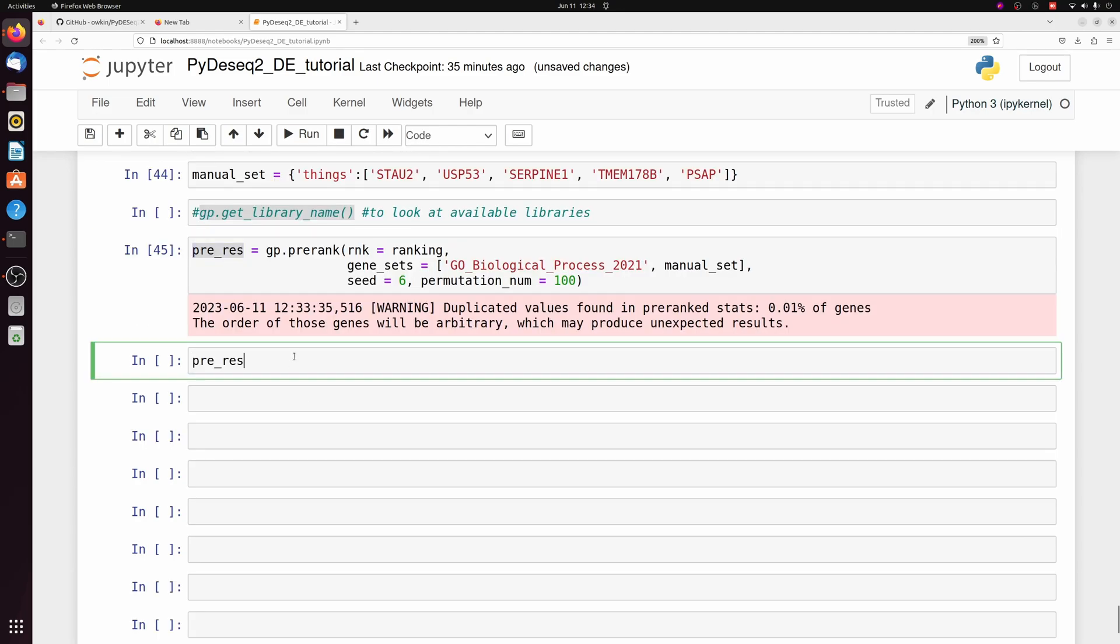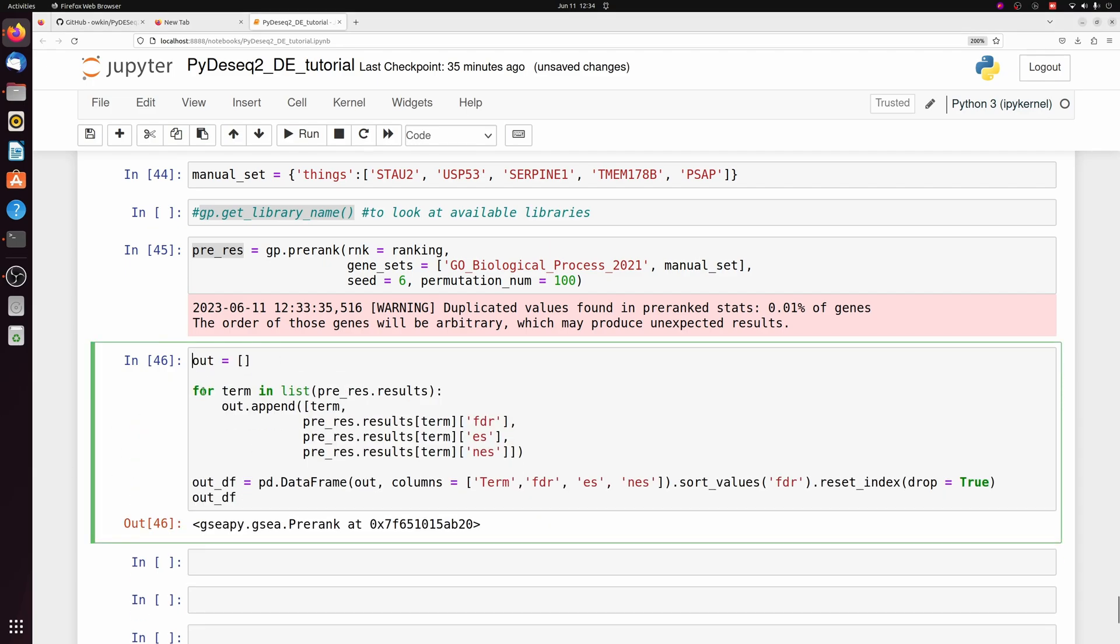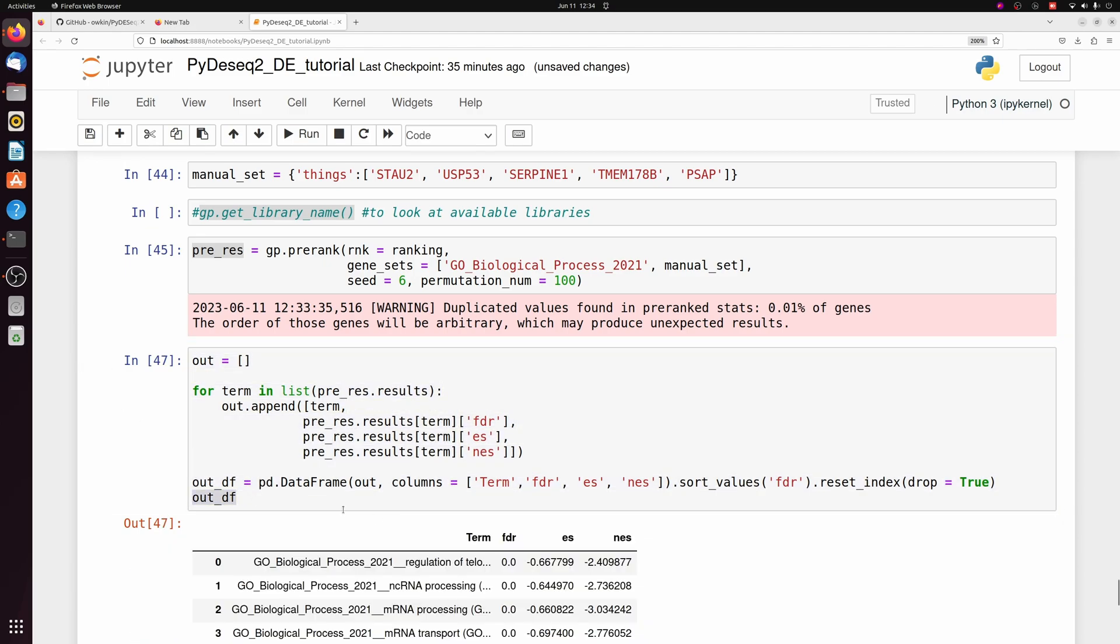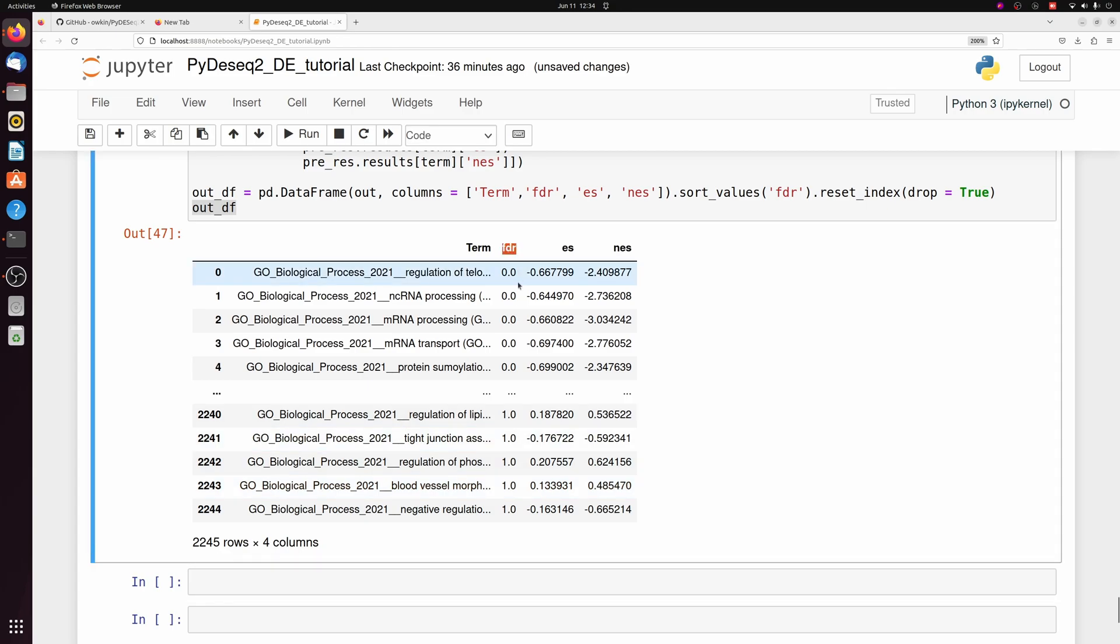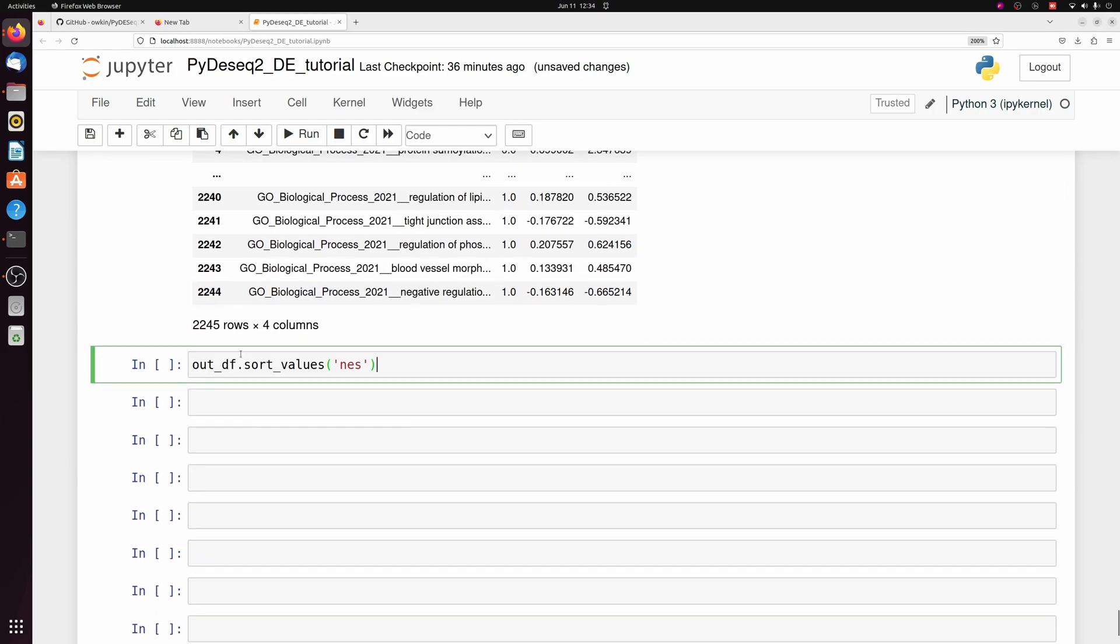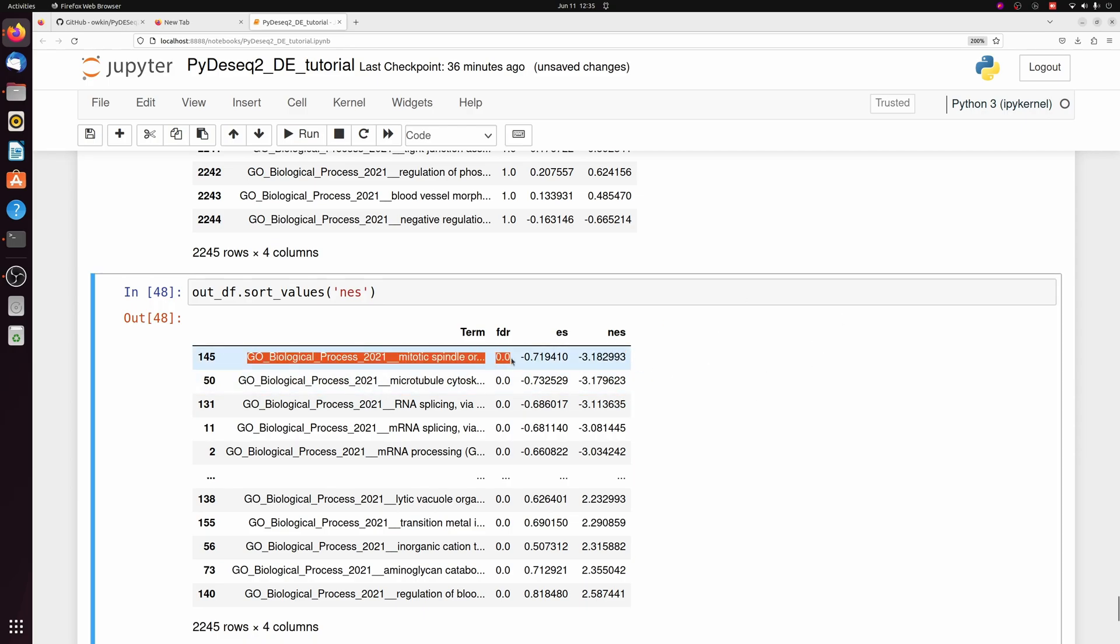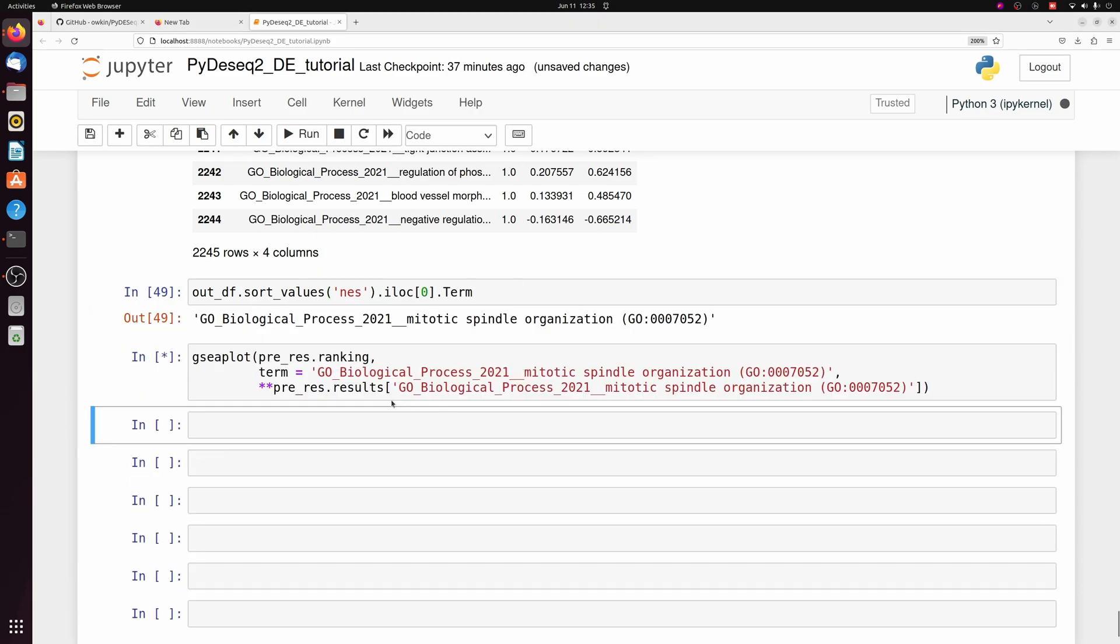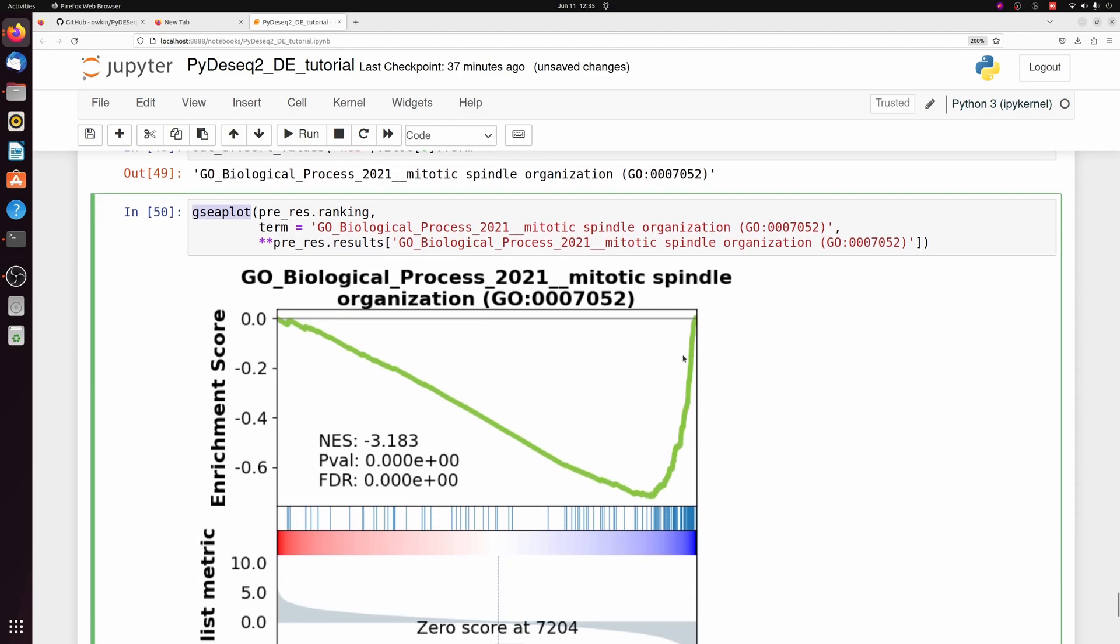So we have our pre-res, which is a class object. But from that, we can actually get a data frame. They don't have a nice little function to do that, but I made one here. You can just copy and paste this from my GitHub, which actually is going to make an out data frame with the term, with the FDR value, so the p-value corrected, the enrichment score, and then the normalized enrichment. So we can sort that to get the most enriched, or in this case, negatively enriched. And then you can take the term. For example, if we wanted the first term in this data frame, we can make a GSEA plot like this.